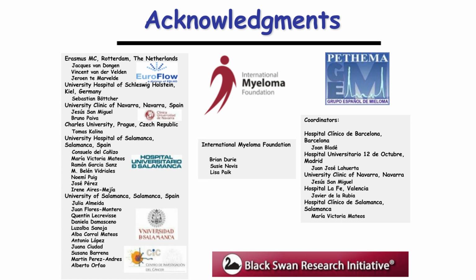So to make sure that we have enough cells to reach that 10 million and keep the highest sensitivity that we can achieve, we recommend starting the protocol with 20 million. So we, in all cases, will be able to recover 10 million cells at the end.